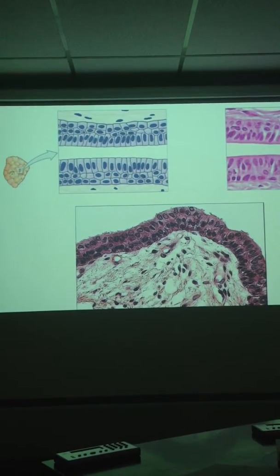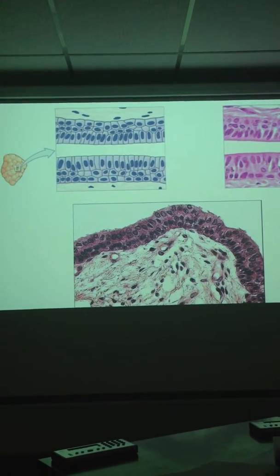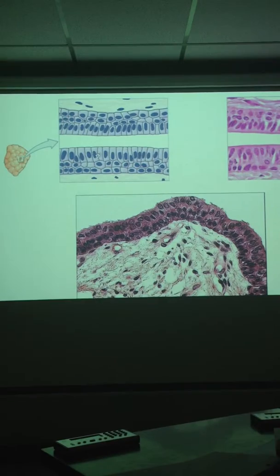Now, this is from a salivary gland. Columnar. Which goes back to duct, so some gland. Stratified columnar. Got to look at the apical cells or the luminal cells.